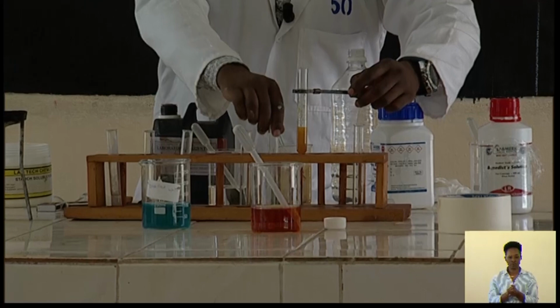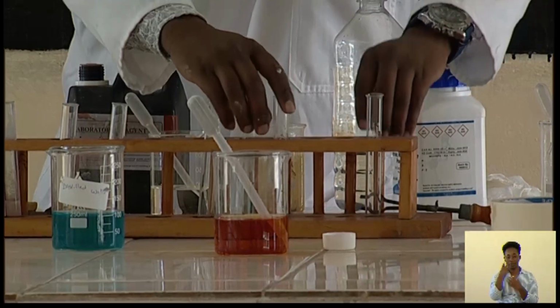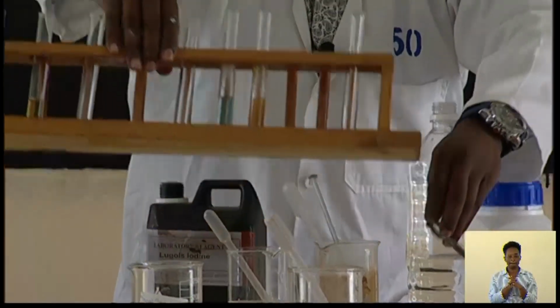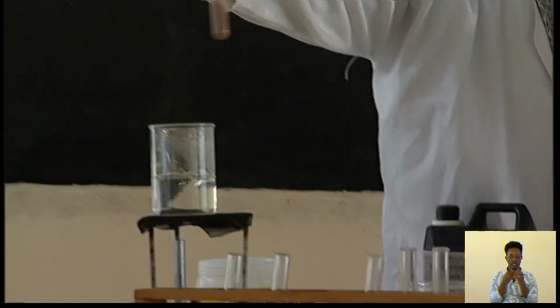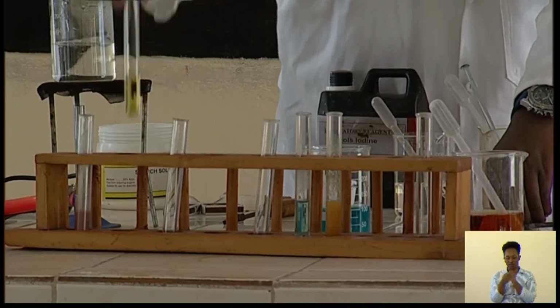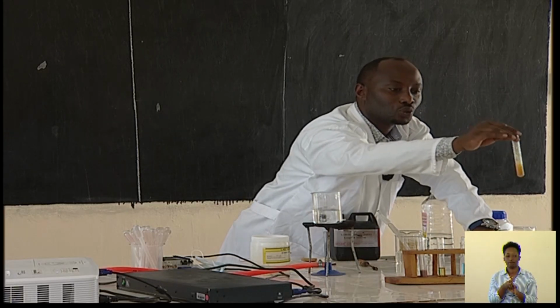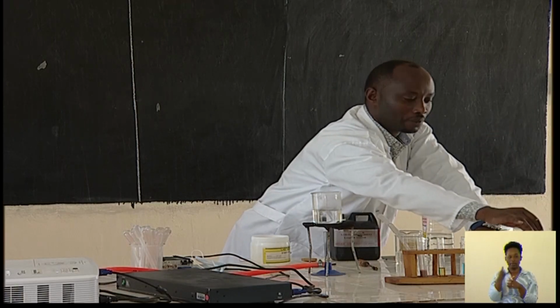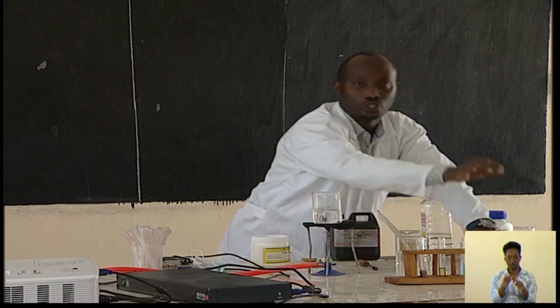We have done two practical lessons. I think you have seen it, and everybody can observe from in front of you. Number 1 was testing the presence of starch. It turns blue-black. This one persists, so there is absence of starch. And this one changed into orange, which indicates the presence of reducing sugars. Here, the color of the Benedict's solution persists, so there is absence of reducing sugars.